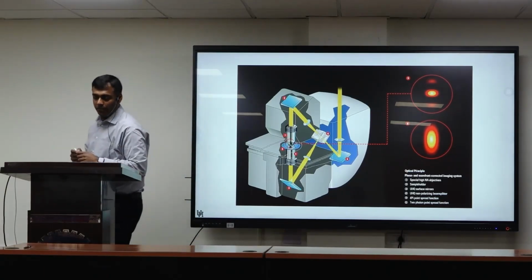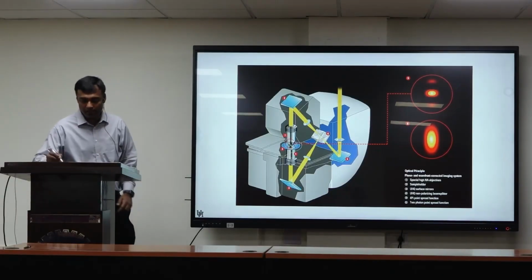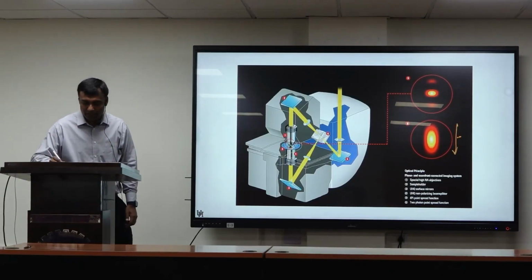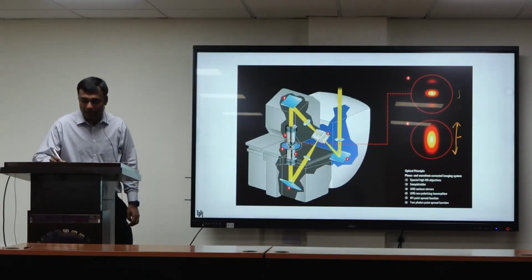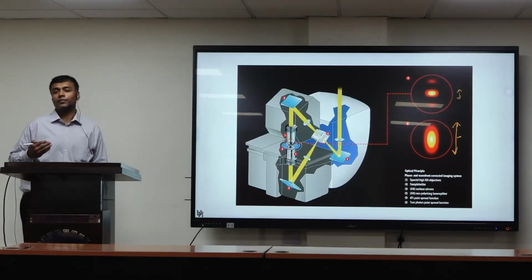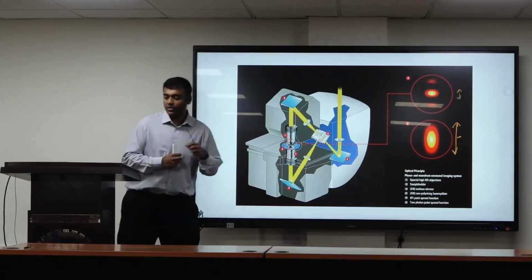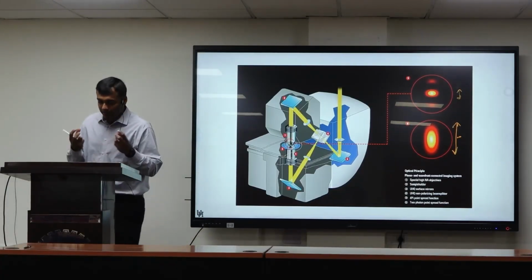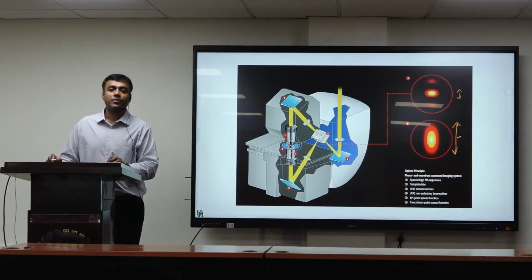It's both along XY and Z, but the Z one matters a lot more, as you can see. So instead of this being your resolution in confocal, this is your resolution with this 4-pi confocal. So now you are increasing the range of angles that you collect, and that way you are getting much higher resolution of image.